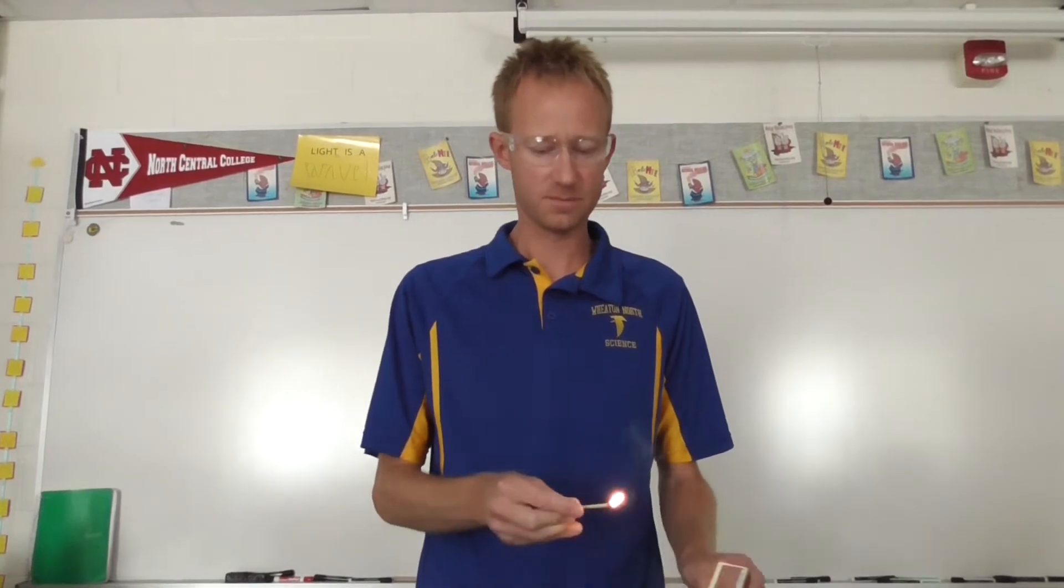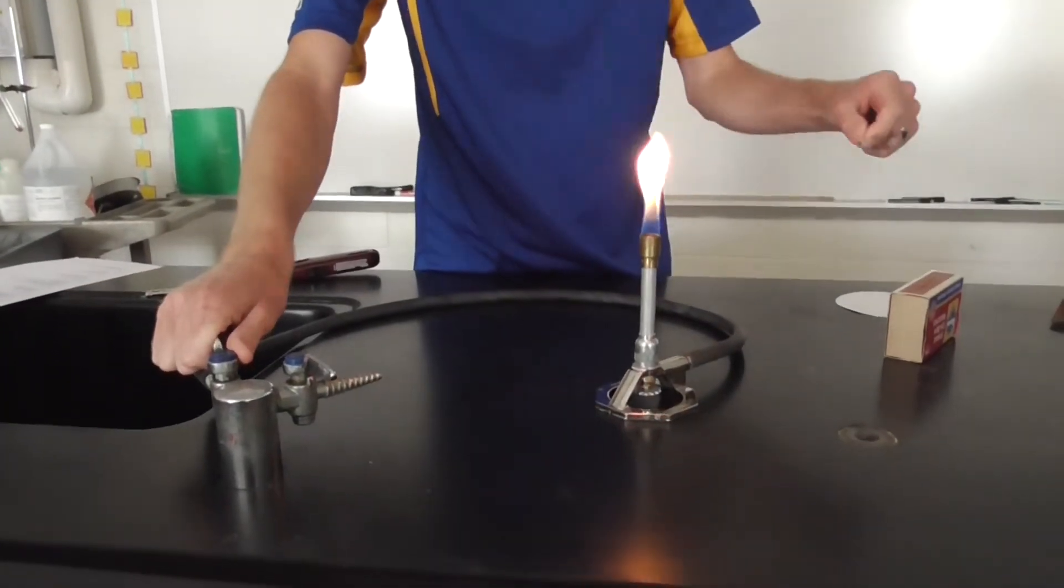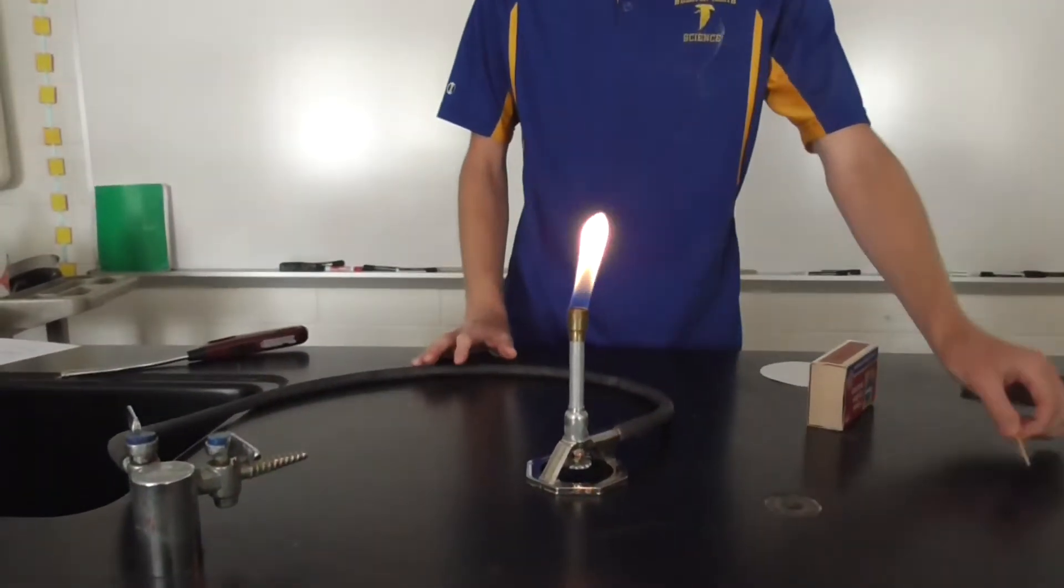So remember, first light the match, then turn on the gas jet. Light the match. You can turn the gas jet on all the way. You don't have to turn it on slowly. And you can set the match on top of the counter.